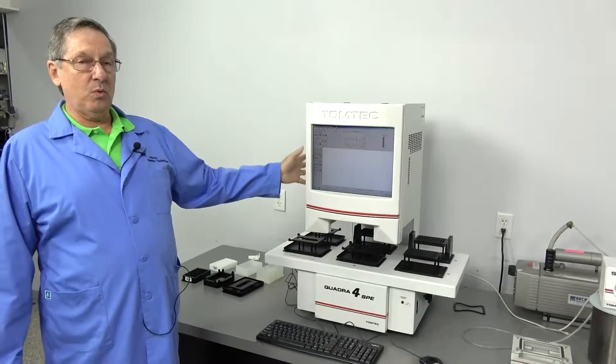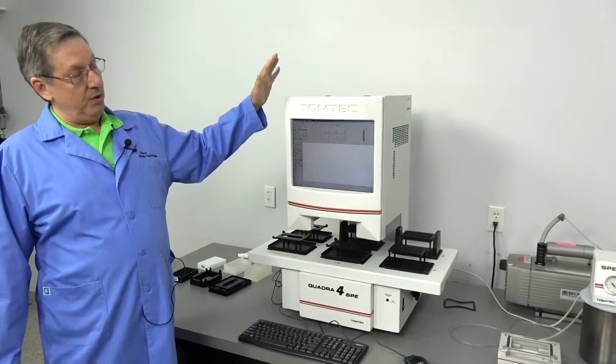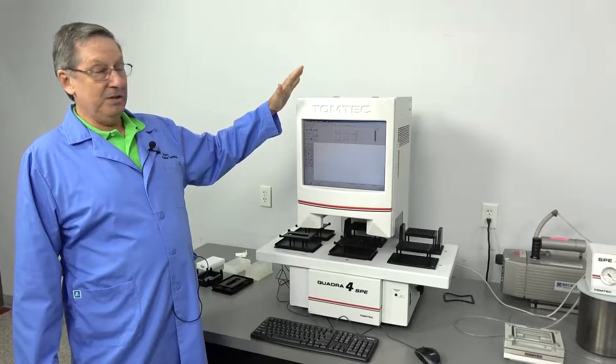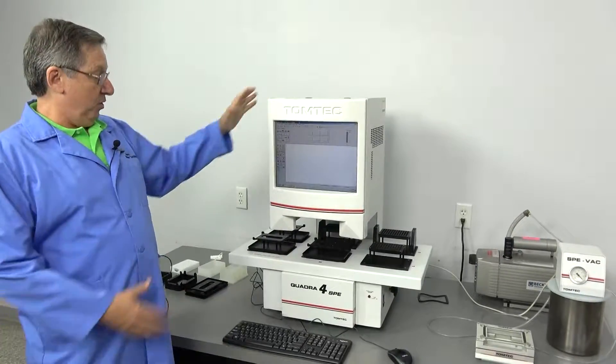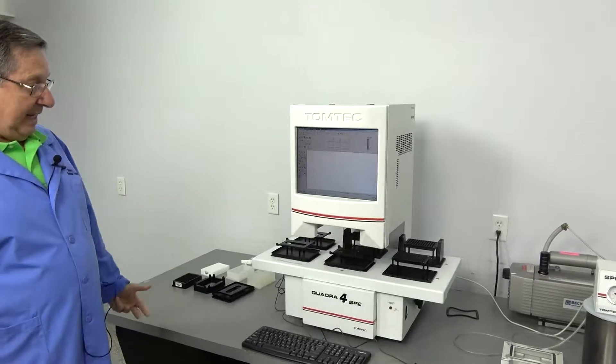One of the advantages of the Quadra series, it's an all-in-one unit. The computer compressor is built into the unit, so it doesn't take up a lot of space and moves around fairly easily.